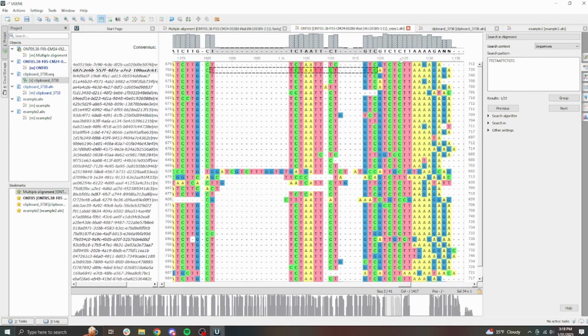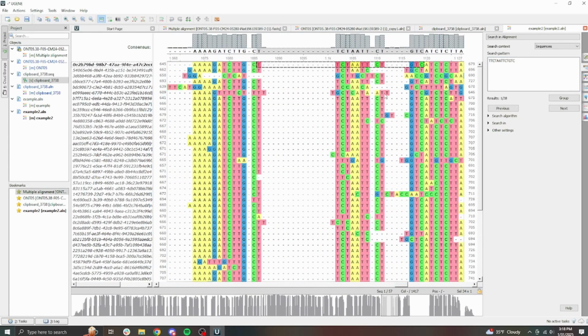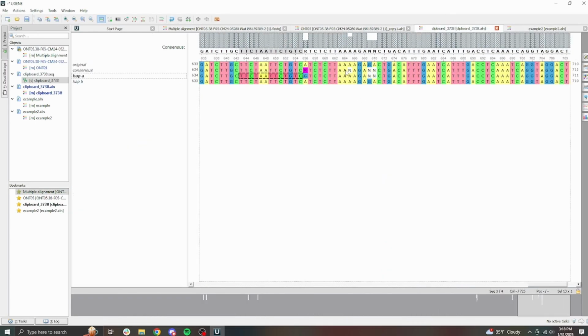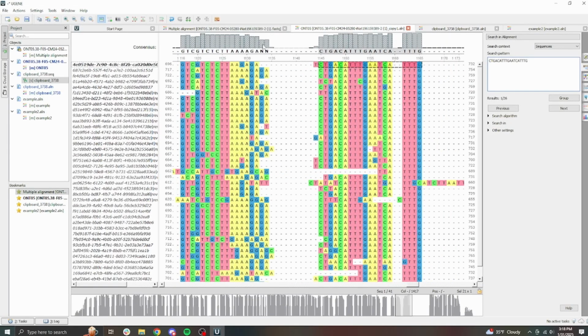Didn't realize this one would be quite so time consuming. Sorry about that. A, it's GA, so that's definitely an R. That A certainly doesn't belong there. GA. Definitely GA.